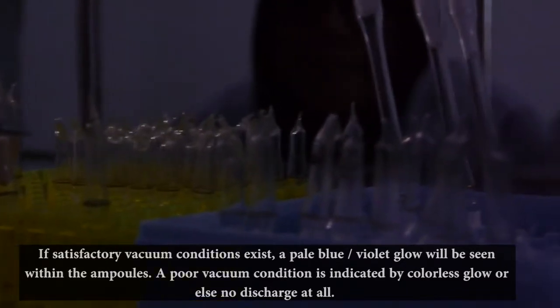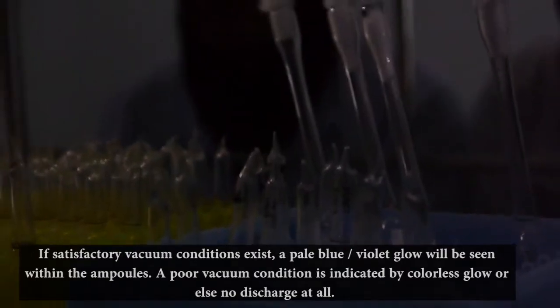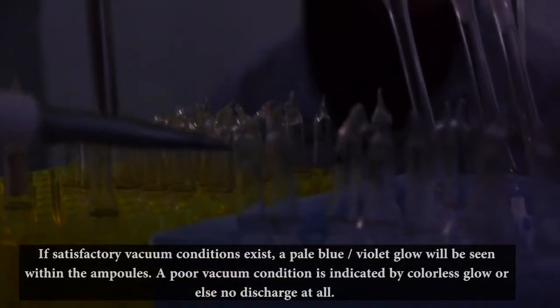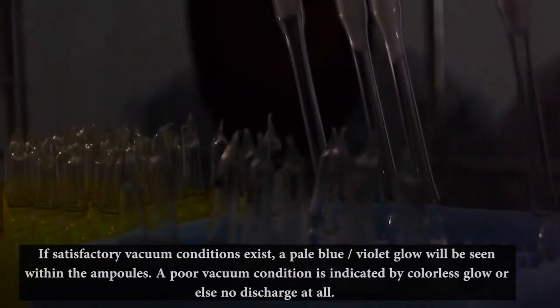Also, there is no color. There is this color, but the color is only the spark outside the ampule. No color like this. You see, they have the color inside, right?